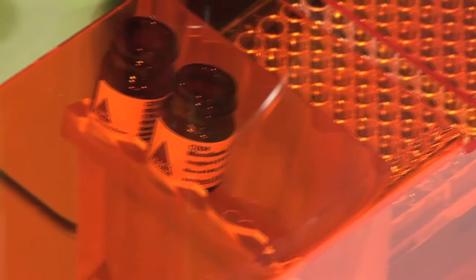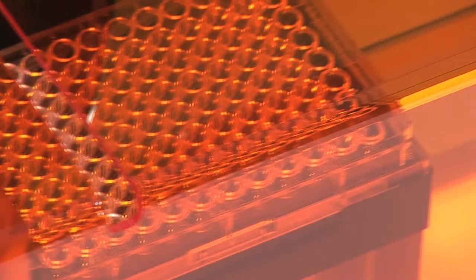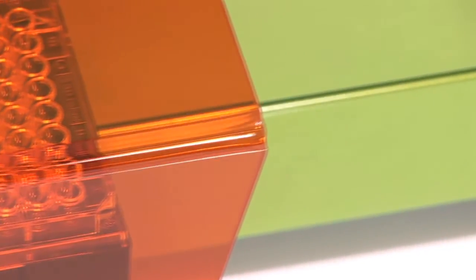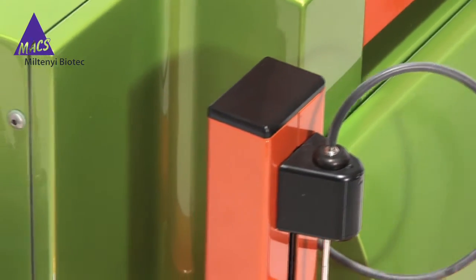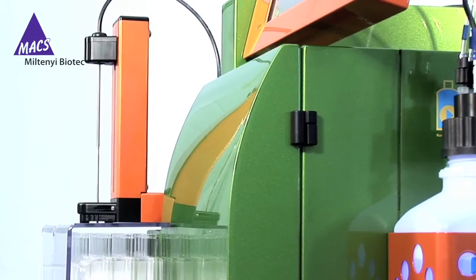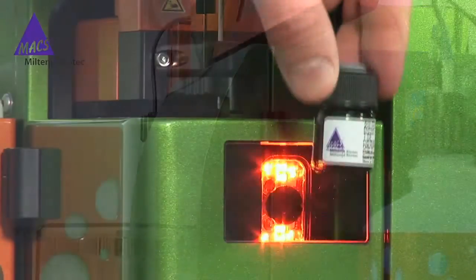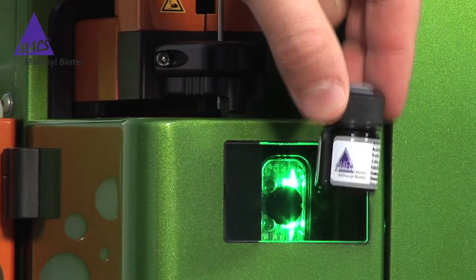Flow cytometry solutions from Miltenyi Biotec let you get the most out of your research, from immunology and hematology to cell biology and systems biology. In fact, thousands of distinguished scientists from eminent research centers such as Caltech and the Pasteur Institute rely on Miltenyi Biotec's flow cytometry solutions.